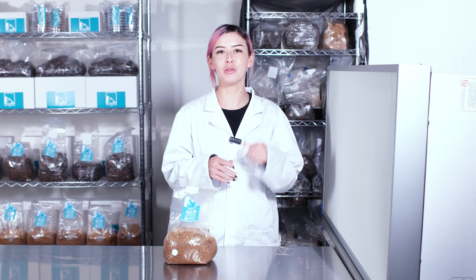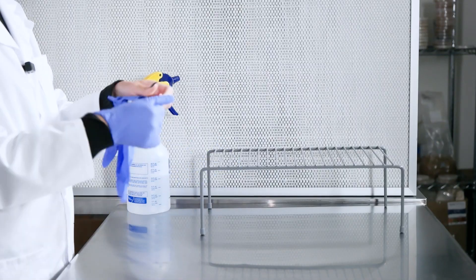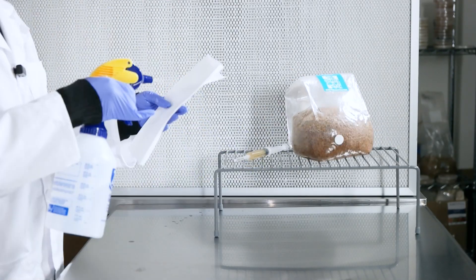If you want to grow mushrooms you have to learn how to inoculate like a pro — this is where the magic happens. The first step is to get your workstation all set up. Put on your gloves and wipe everything down with isopropyl alcohol. We don't want any unwanted guests crashing our mycological party.